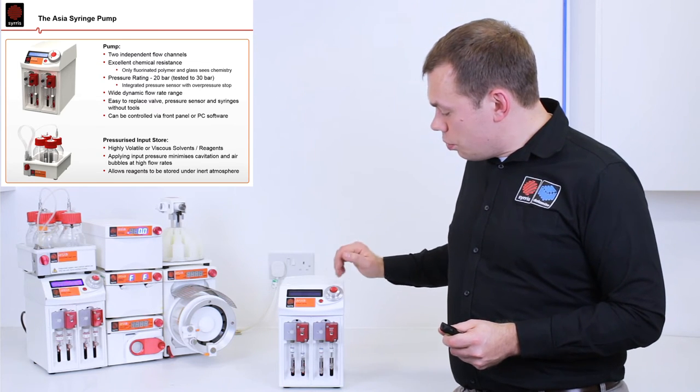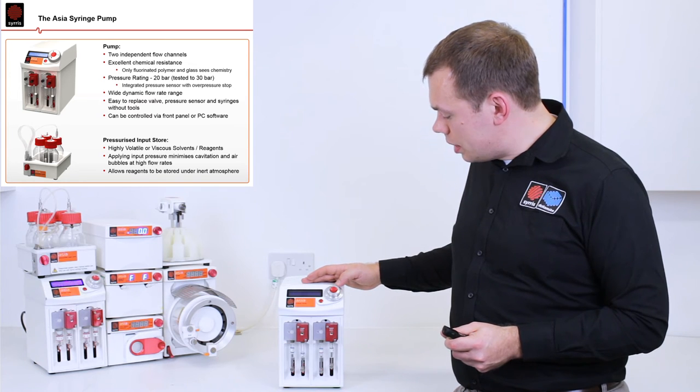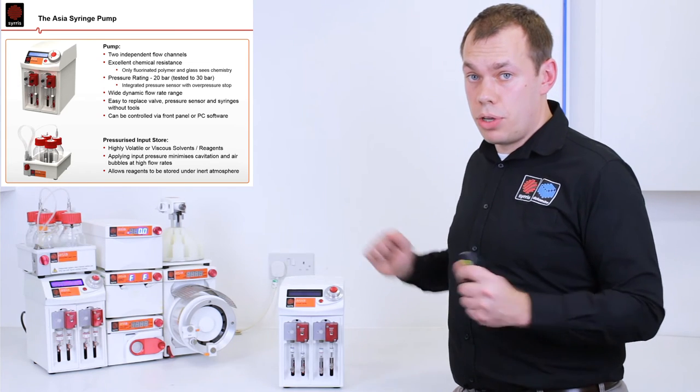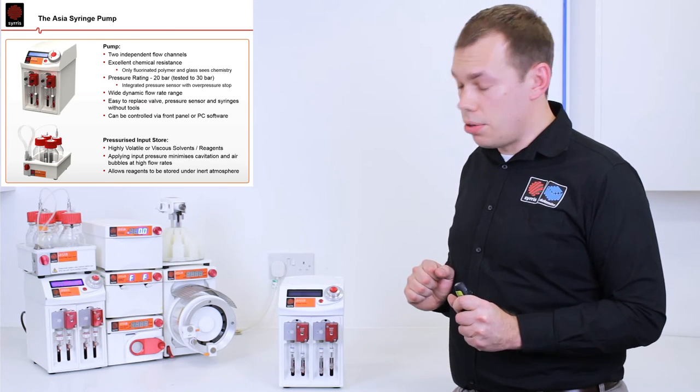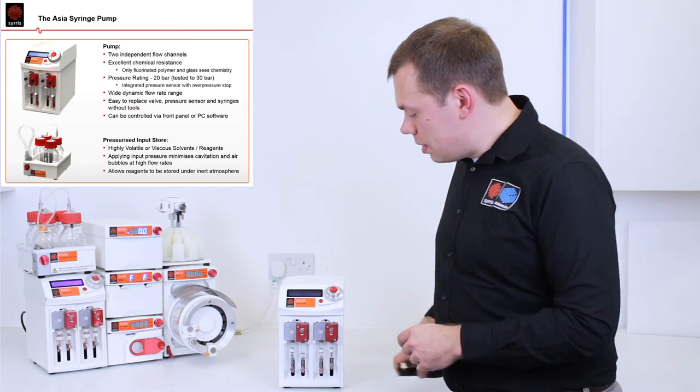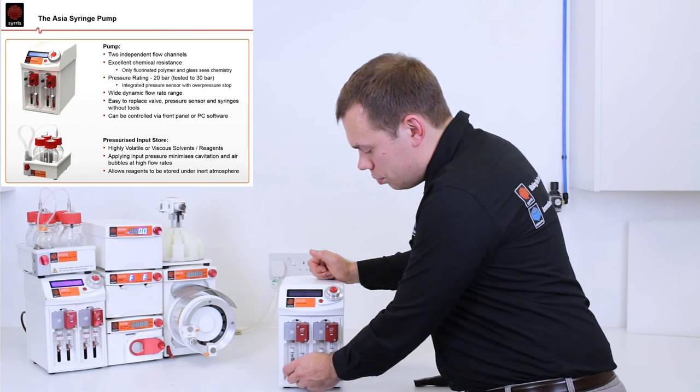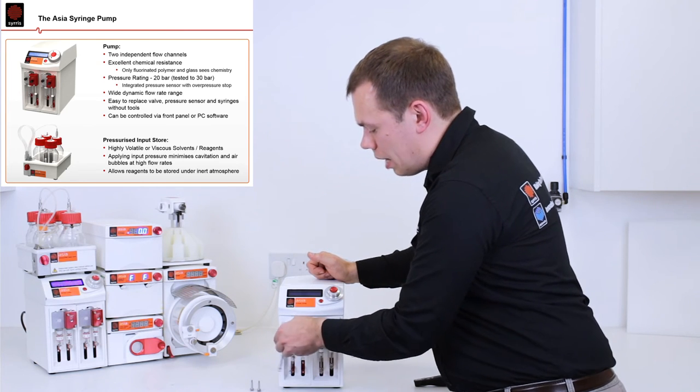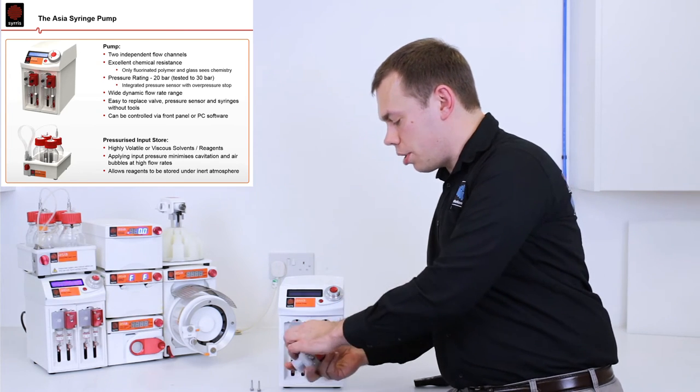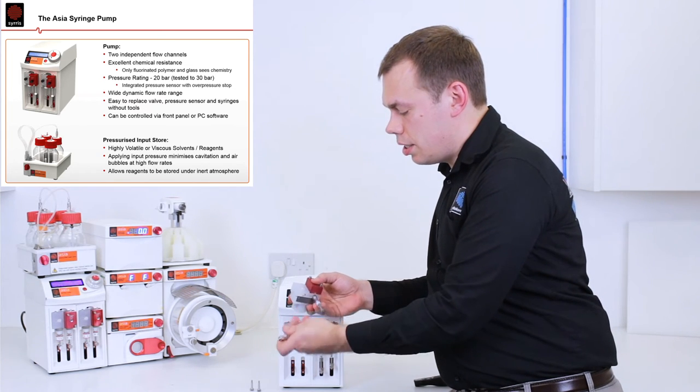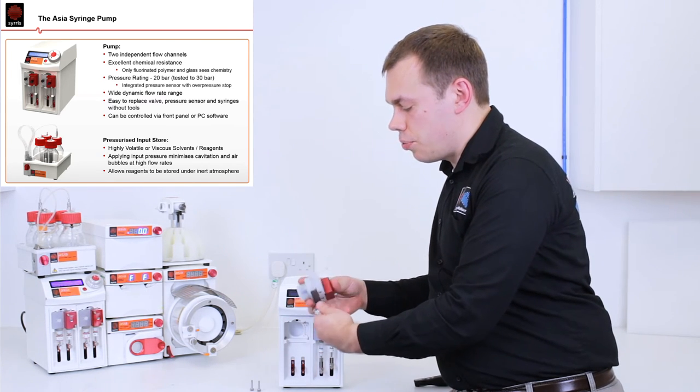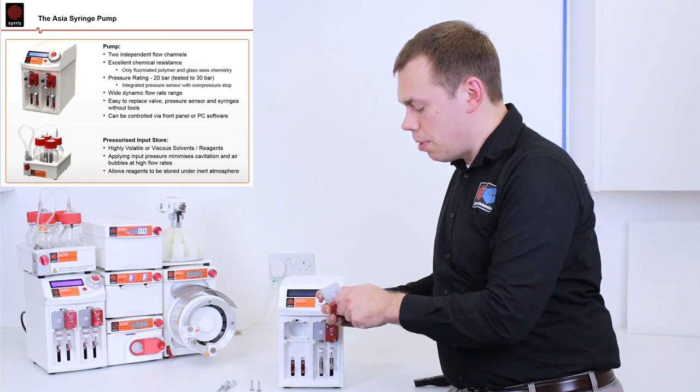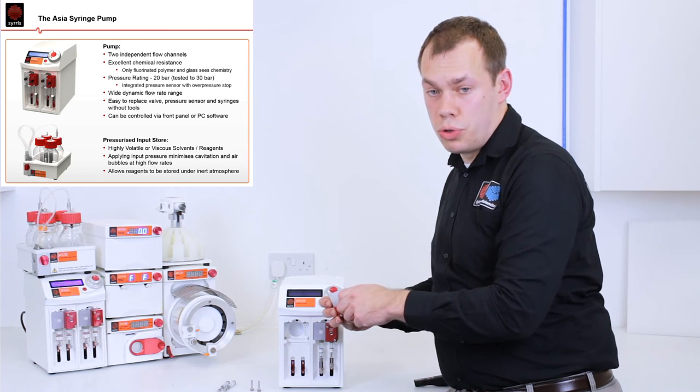The pump can be controlled from the turn and twist and click wheel or connected to a computer by a USB cable and fully automated by the Asia manager software. The pump is easily serviceable by removing the two thumb screws at the bottom. You can then pull out the full block and then access each individual part such as the syringes or the valve block. So you can service the pump with minimum effort and no tools required.